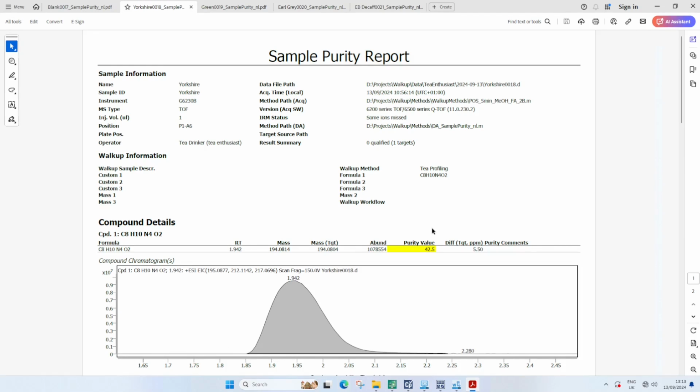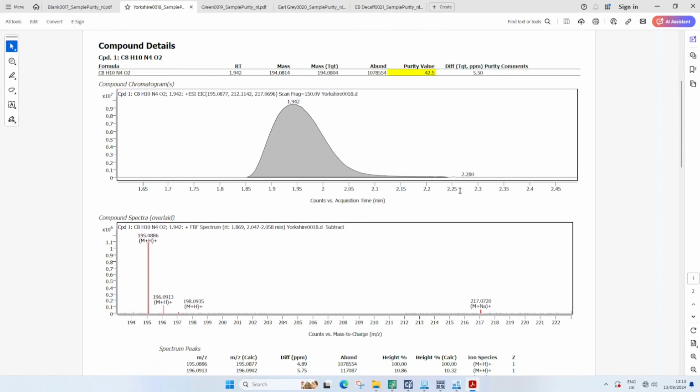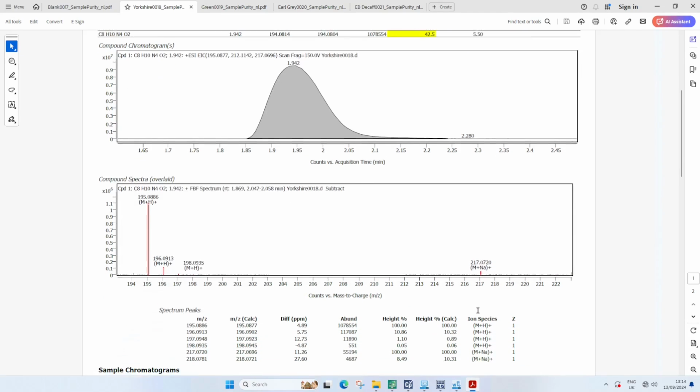So in this case, we can see a mass spec peak. It's quite a strong peak here. We're getting tens of millions of counts with abundance values, and we also get a purity value. How pure is this relative to some of the other peaks in the UV chromatogram? There's been a correlation between the UV and the mass spec. So just to confirm, we are detecting the caffeine molecule as a protonated as well as a slight sodiated abundance. So some of the ions monoisotopic masses are there.